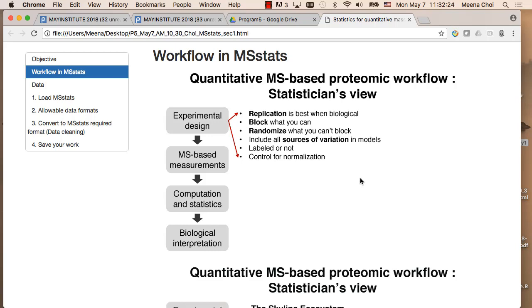Okay, so I think I can start. From now to the end of today, you will work with me. It will be a long day, and today we are only working on MSstats. Olga introduced the iPRG data, and people who attended the previous class may have heard about the iPRG data set. In this section, we are going to work with the whole iPRG data, and we use four different processing tools: Skyline, MaxQuant, Progenesis, and OpenMS.